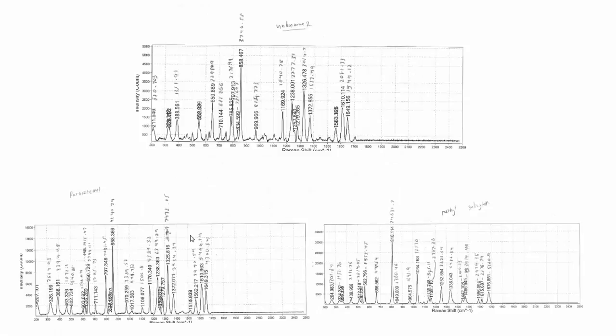As you can see from the Raman, there is a strong correlation between the unknown compound and paracetamol, as they have virtually exactly the same peaks at 858, 1169, 1326, and 650. But this is not as similar for the methyl salicylate.